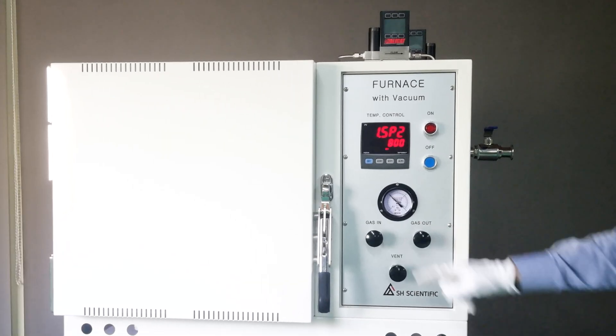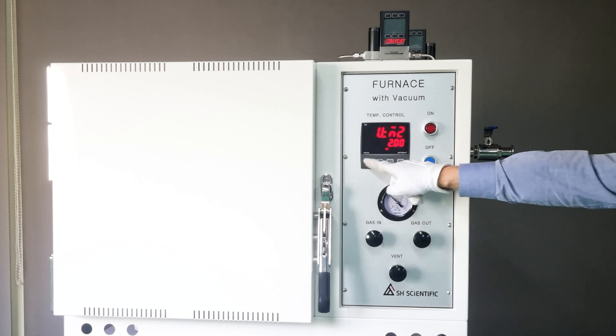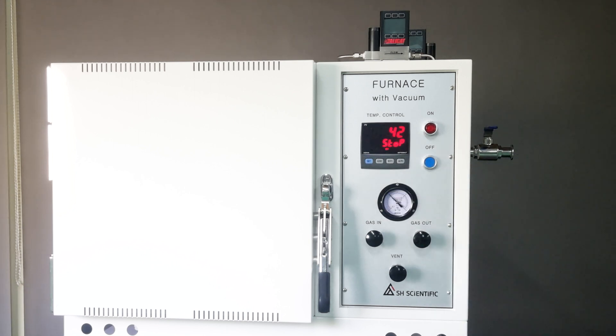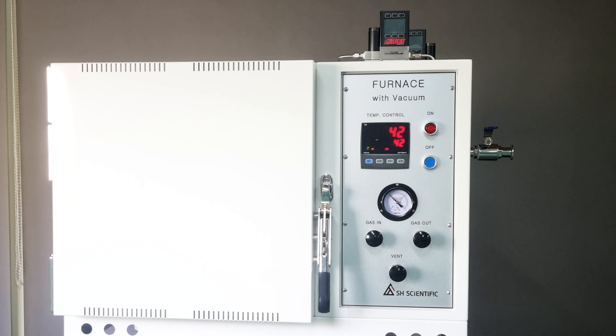At this point, I've finished entering the program, so I'll press and hold Set for 3 seconds to return to standby mode. Then, press and hold the Pattern button for another 3 seconds to start the controller. Finally, press on, and the furnace will begin heating up.